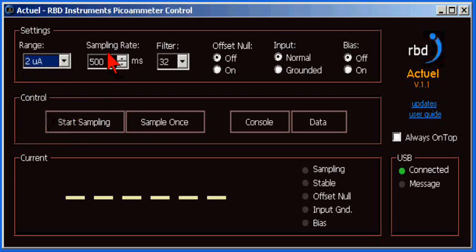Next, you can change the sampling rate, which is how often a measurement will be acquired, from 25 milliseconds to 10 seconds. For most spectrometer applications, 500 milliseconds is about right.